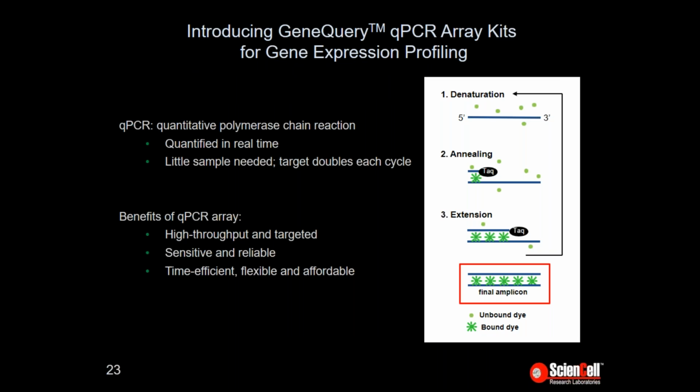One way to compare two different cell populations is by analyzing how they differ in their gene expression. We recommend using qPCR to do this because it has high statistical power and is flexible in its design. qPCR takes advantage of the fact that gene expression can be measured by detecting the amount of mRNA present in a cell for that gene, since gene expression is regulated by mRNA turnover.